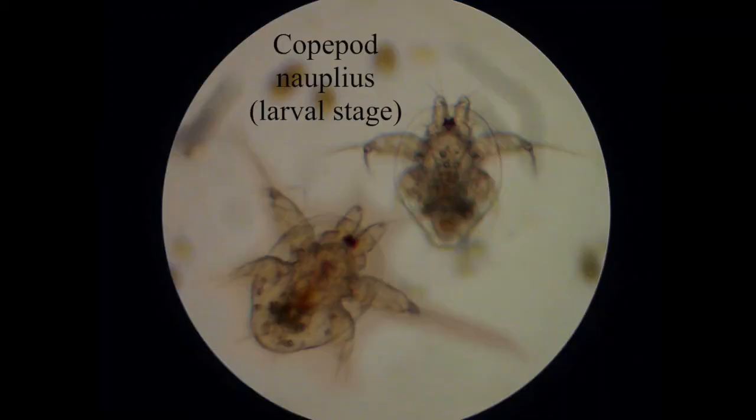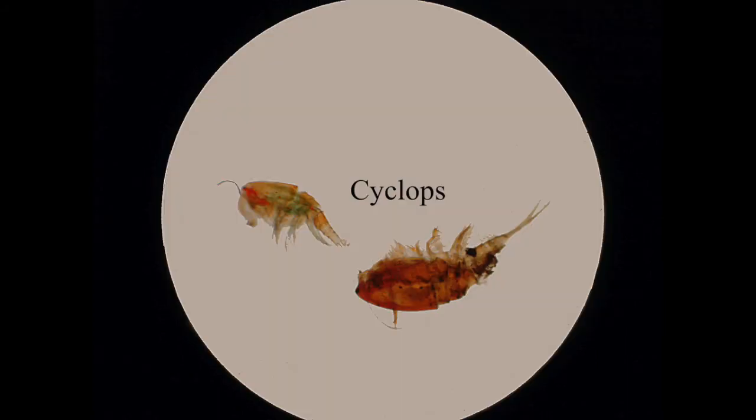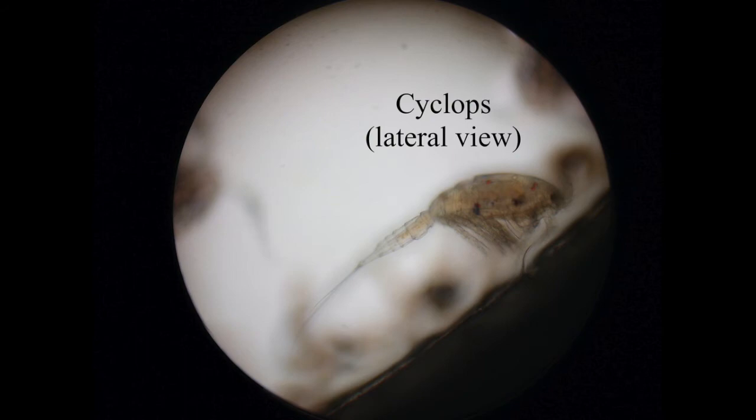Quite a lot of copepods when they're young have this nauplius stage, which is basically a larval stage. What you're seeing here is very typical of what that stage looks like in most copepods. And here is a very typical copepod — cyclops. Those nauplii we saw a minute ago could actually be from cyclops. Cyclops are about a similar size to daphnia, so adult ones are visible with the naked eye.